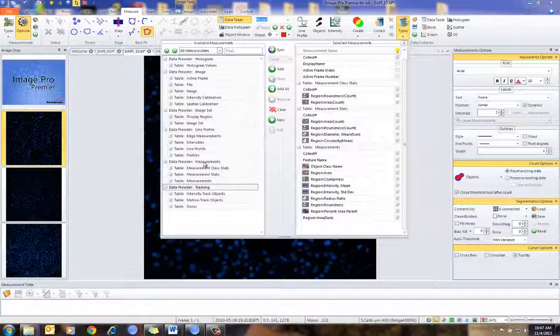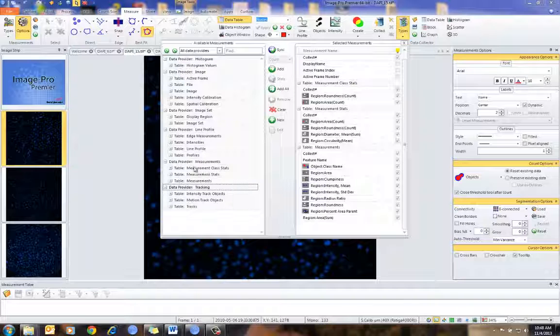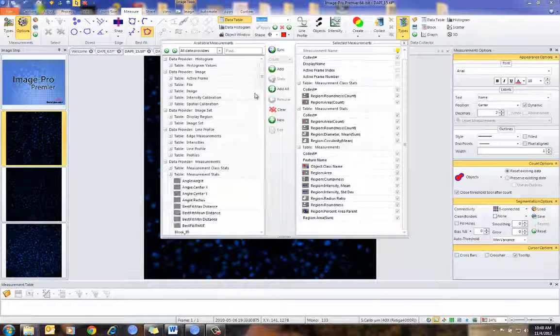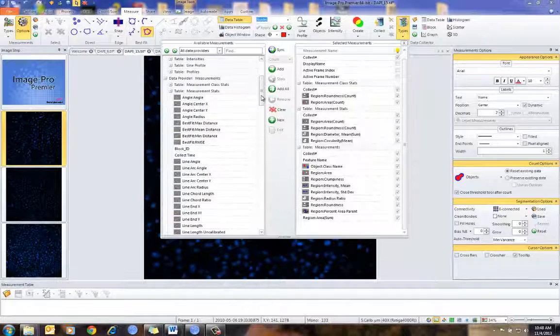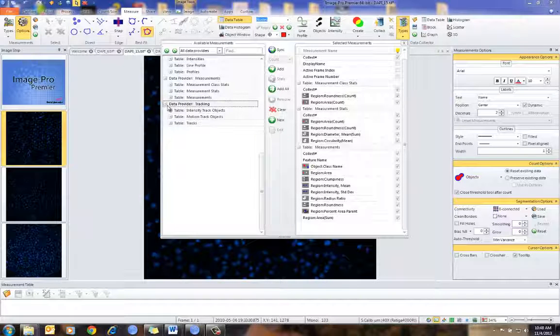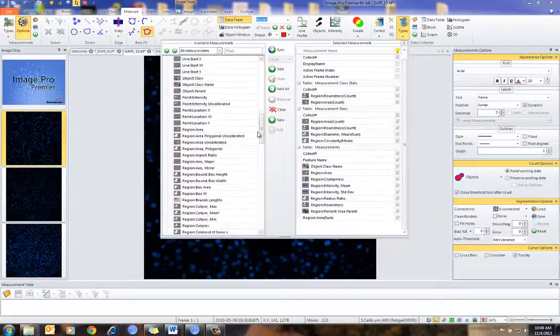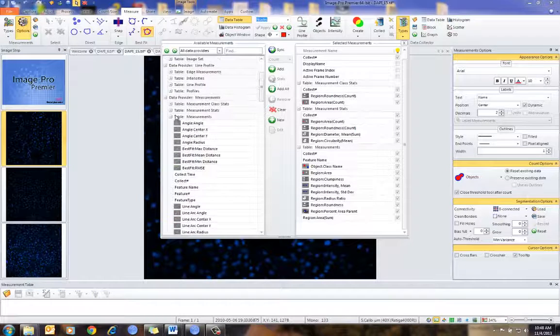For example, I'm going to be using Count Size, so I'll use the measurements data. I can also accumulate statistics — a wide range of statistical data — and also the individual measurements or the raw data for each and every object.